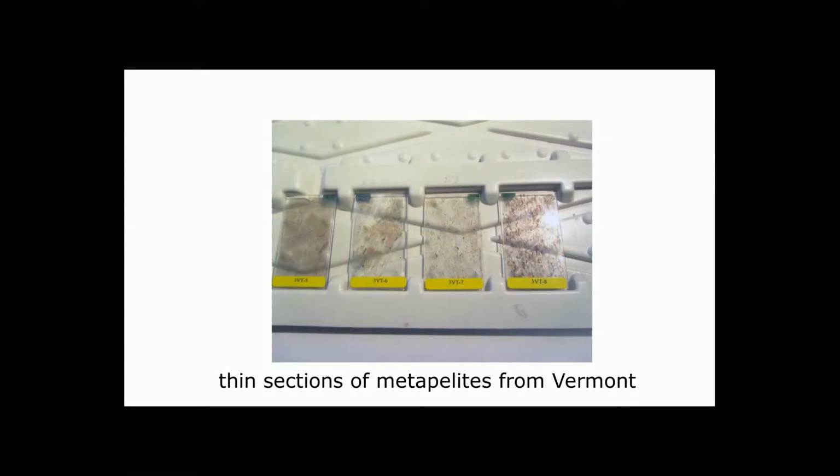And here are some sample thin sections. Notice that these samples here have been polished. They reflect ceiling lights as bright flashes in several places. But sometimes, instead of polishing thin sections, we glue a cover slip to the top of them instead. And the glue between the cover slip and the rock slice fills any cracks or pits that might be present.